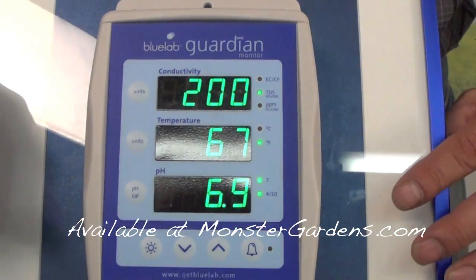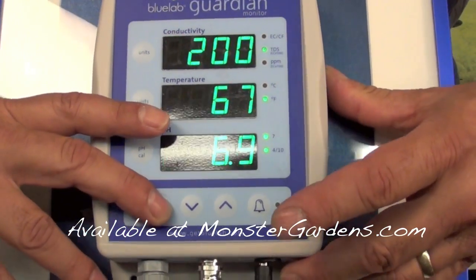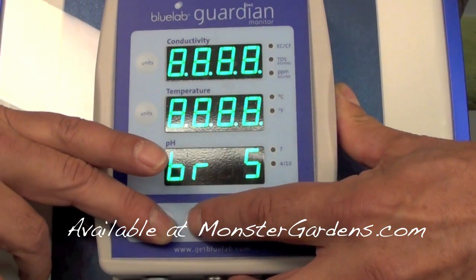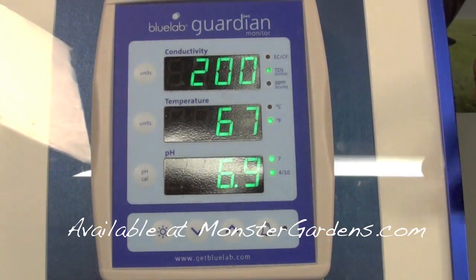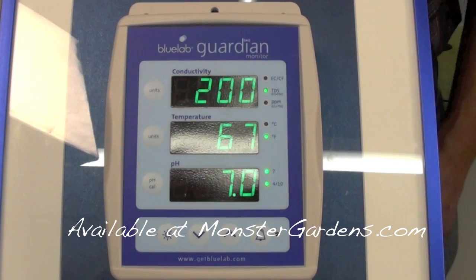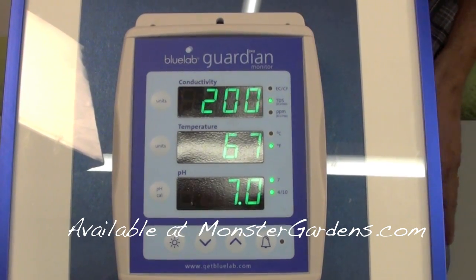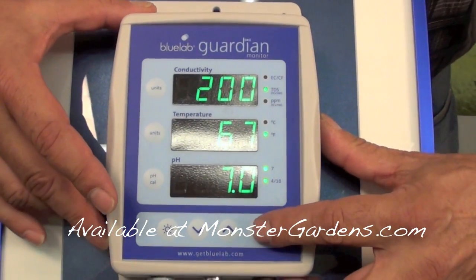What's really nice on the Guardian is you can change the brightness by holding down the button and taking it up to level eight or lowering it down to level one — and the lighting is green. One of the nicest features about the Guardian monitor is also the alarm system. You can set your highs and lows parameters, and when readings come out of those parameters, it's not audible but it will blink to let you know.